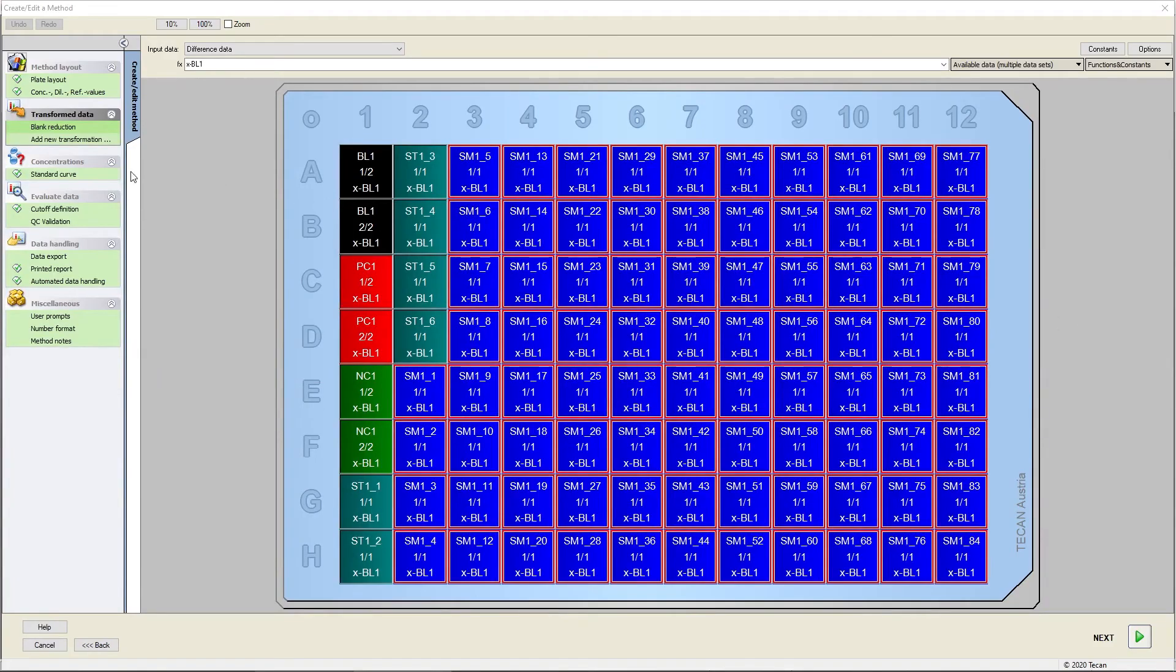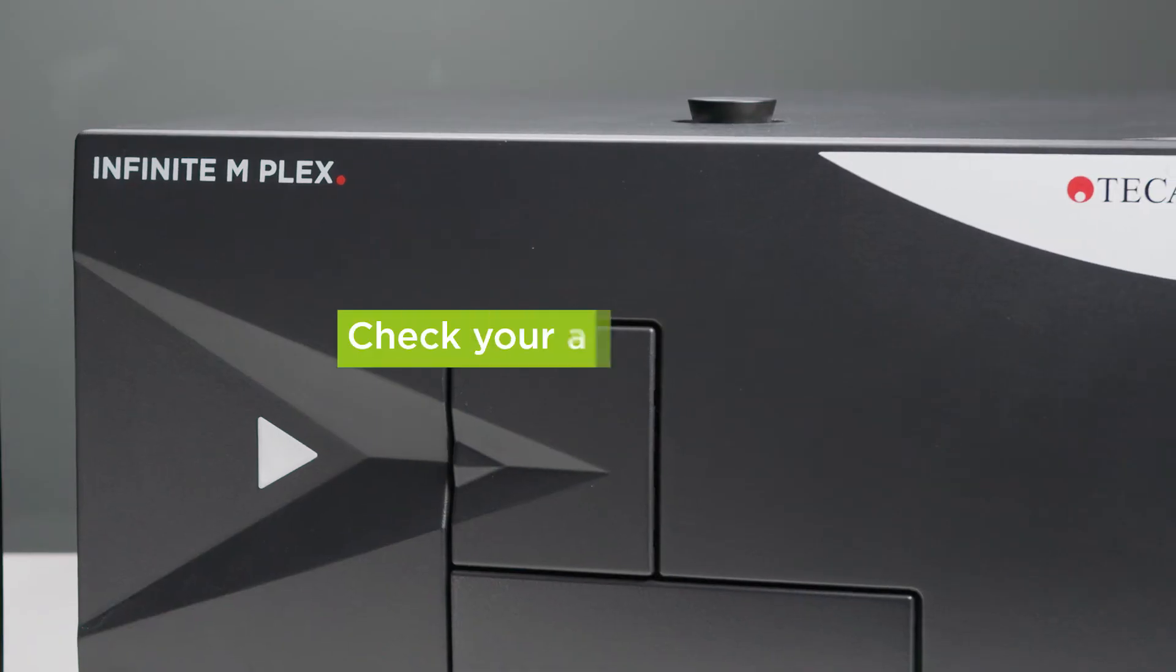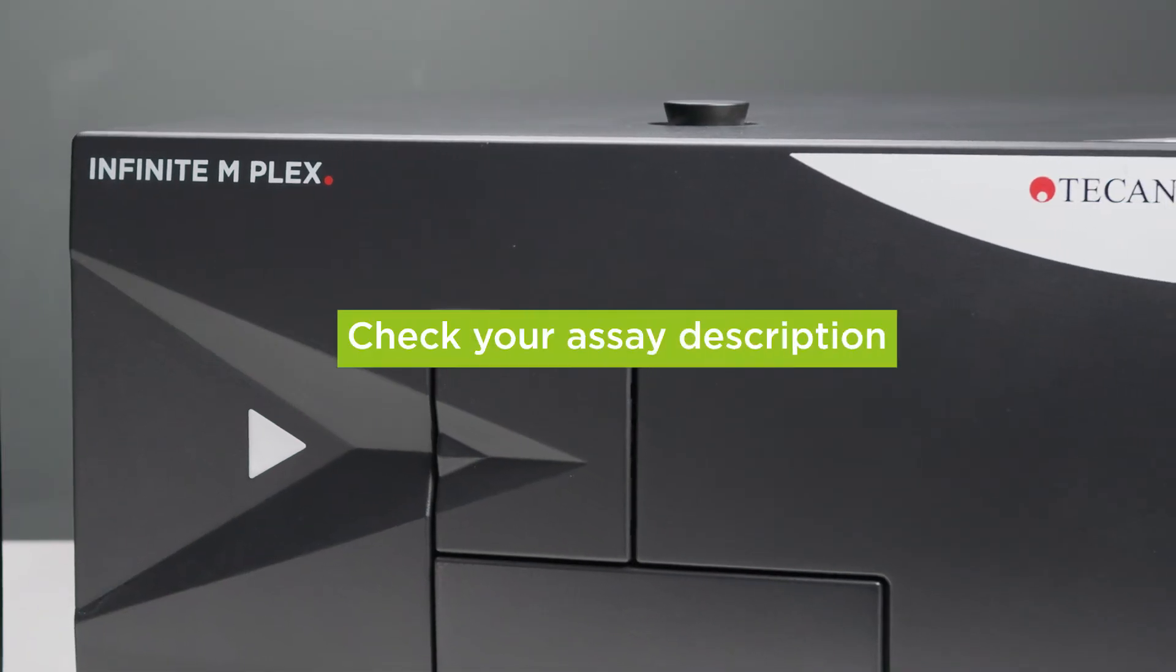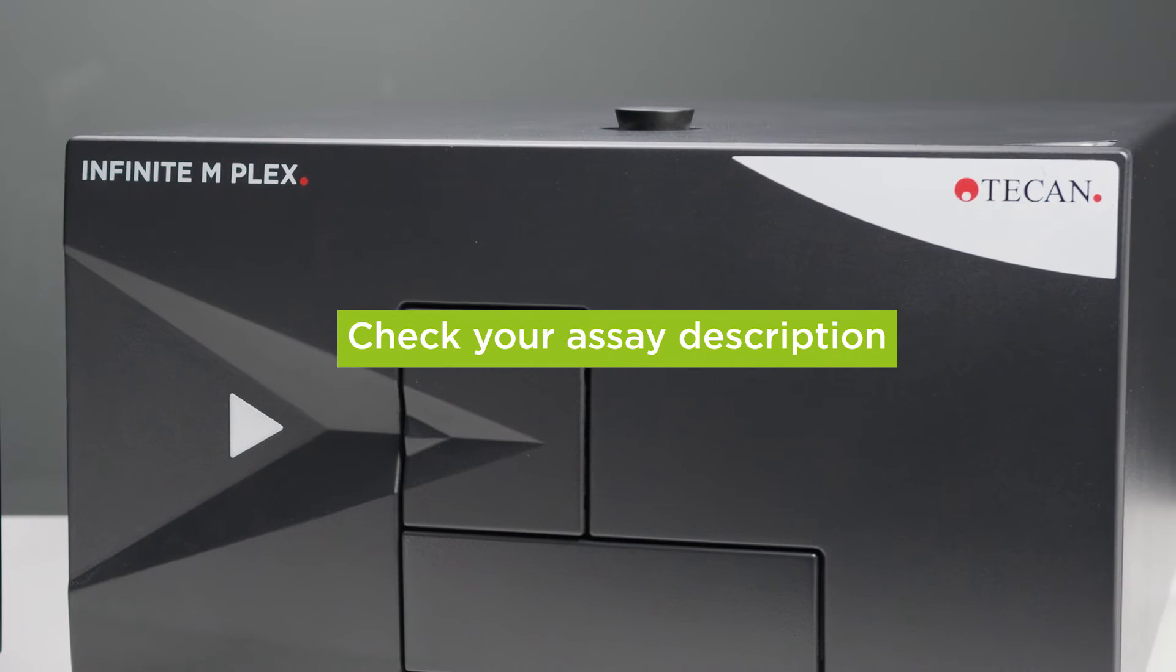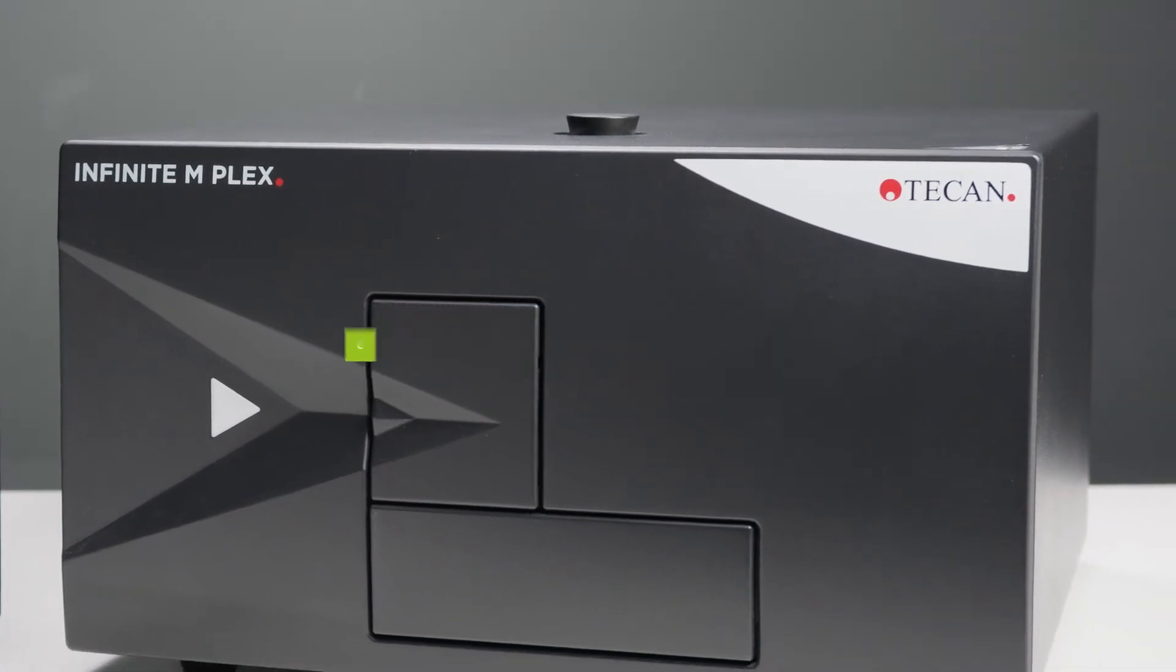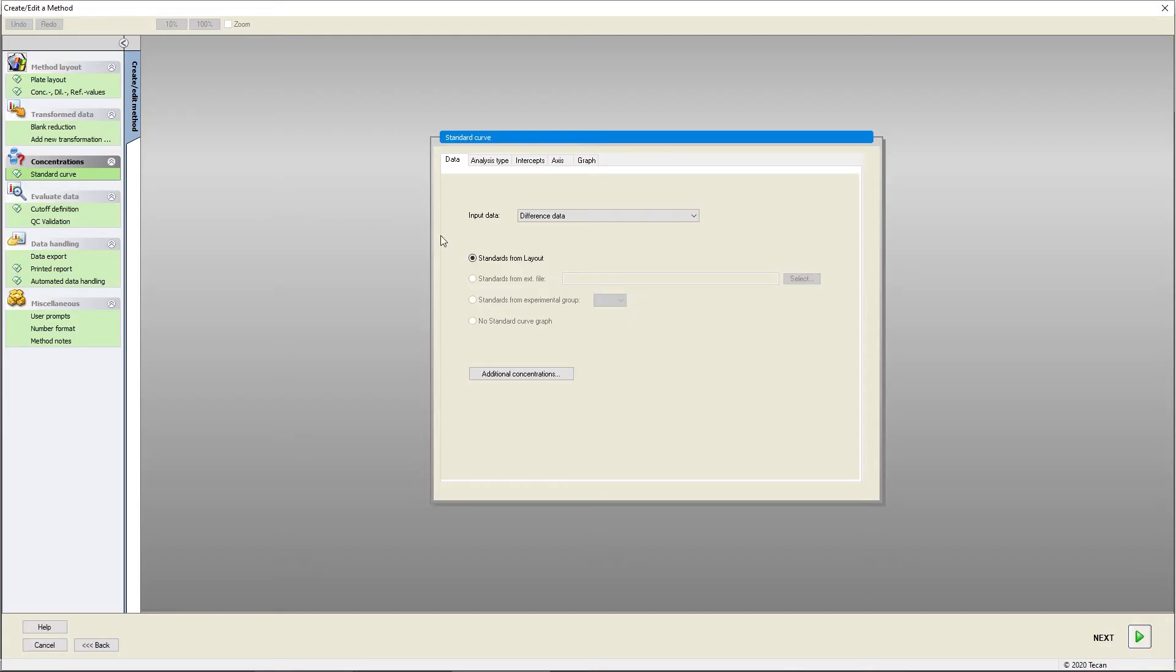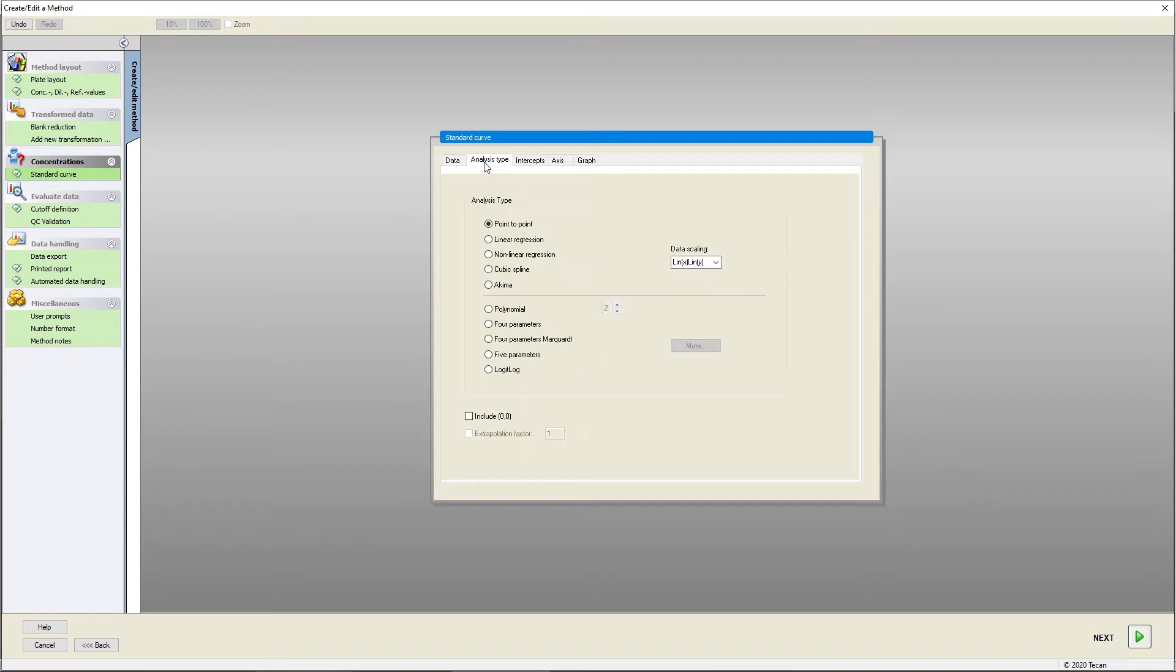Magellan will calculate concentrations based on your standard curve. Please check your assay description to define the standard curve parameters correctly. Make sure to choose the correct input data for your standard curve. Select an appropriate fit according to your expected standard measurement values.